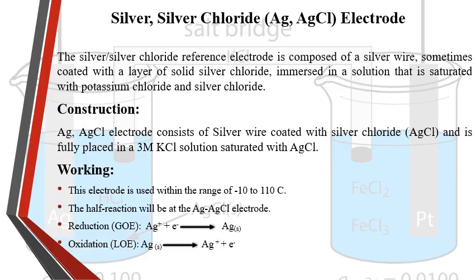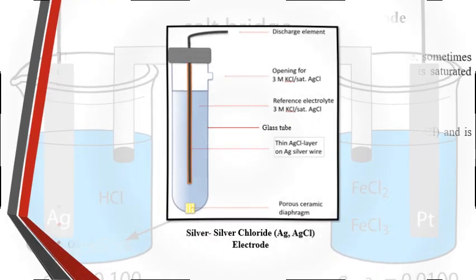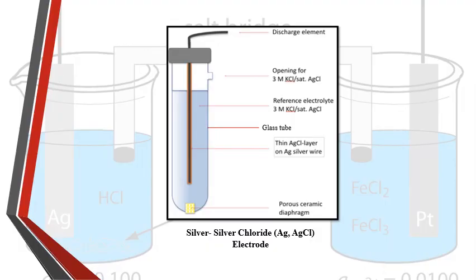Let me point it out. As you can see here and here. And this is how the silver chloride electrode looks like.